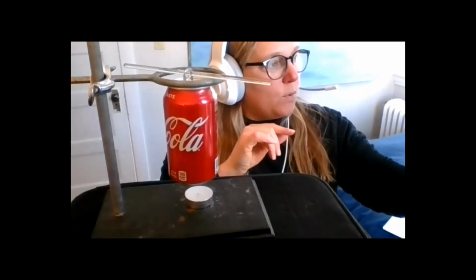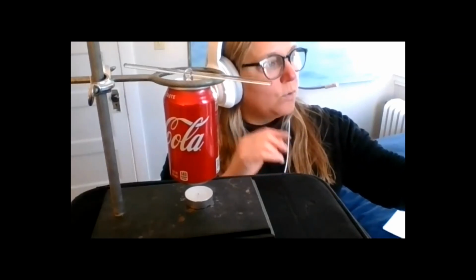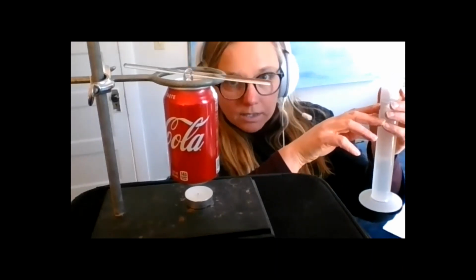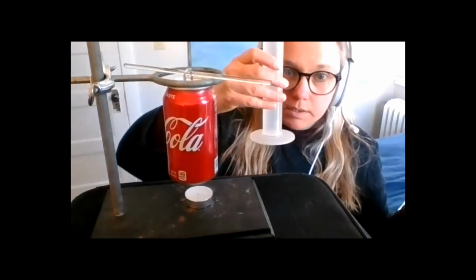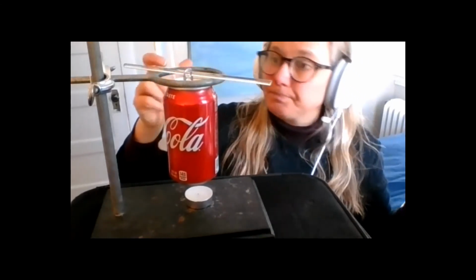So if you have 98.6 milliliters, write that down. Make sure you try to read that thing. You only have to read it once. So just try to read it to the 10th of a milliliter. That means making an estimation between the lines. So you don't have to have it exactly 100, but you do need to read it and tell me exactly what you ended up with.